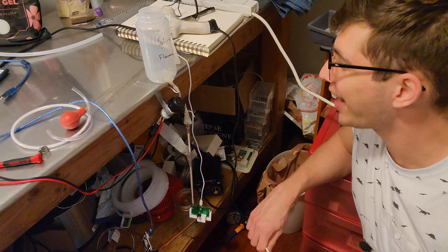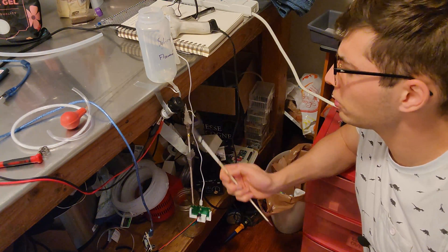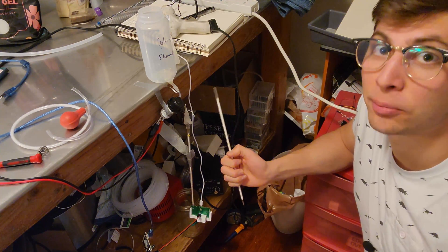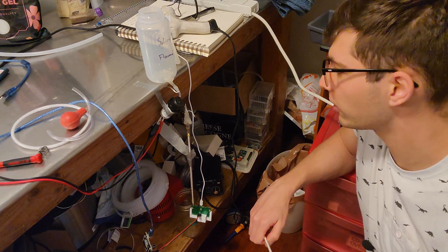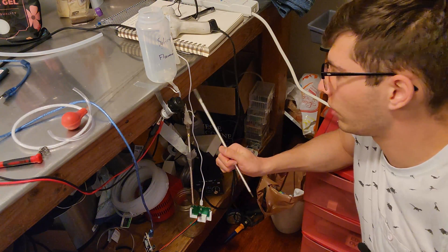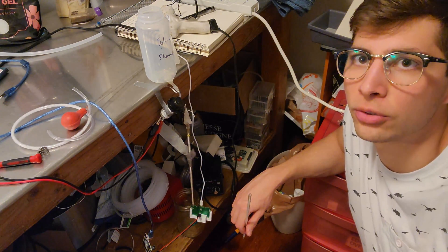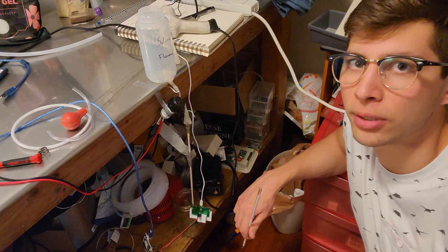So two reasons high pressure is more useful here. This was also a rough prototype, so everything is admittedly hot glued and duct taped together, and I experienced a lot of leaking at all of the joints. Using high-pressure fittings or appropriate fittings would have been much better.